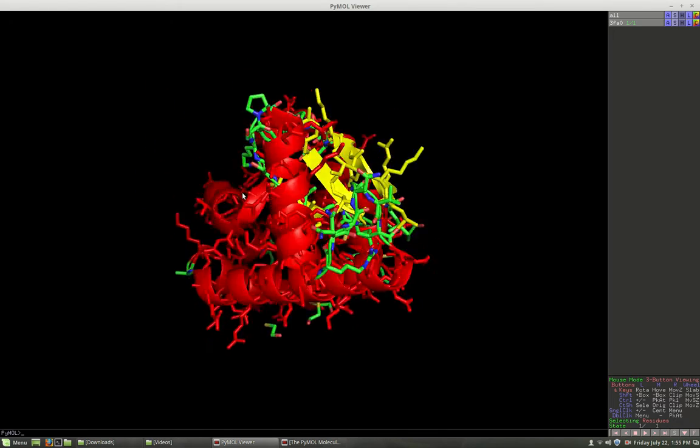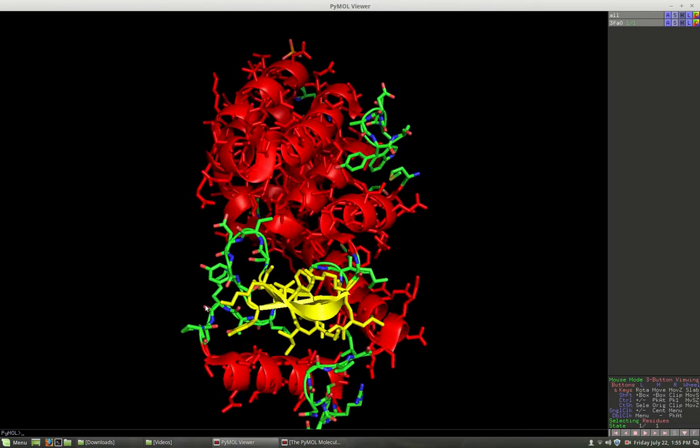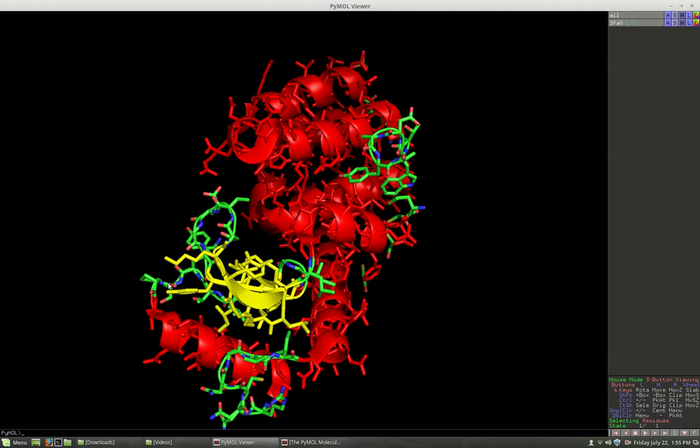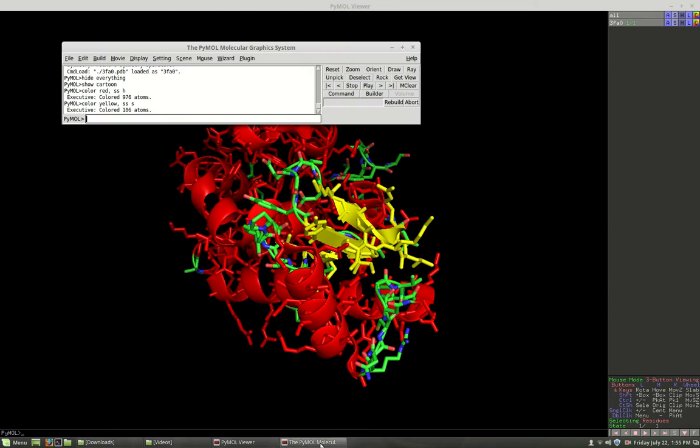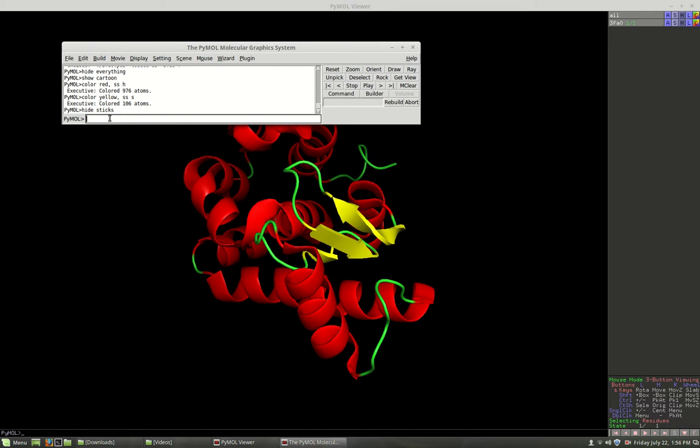But we get to see some of the chemistry of the other things, see if those are odd or different in some way. So we're going to look at this, and we're going to pick out particular residues, particular amino acids that are of interest to us. In particular, I'm going to pick out residue 22, sorry. First I'm going to hide all the sticks again. Hide sticks. Alright, makes them go away. So you see how to do that. But I'm going to show sticks.